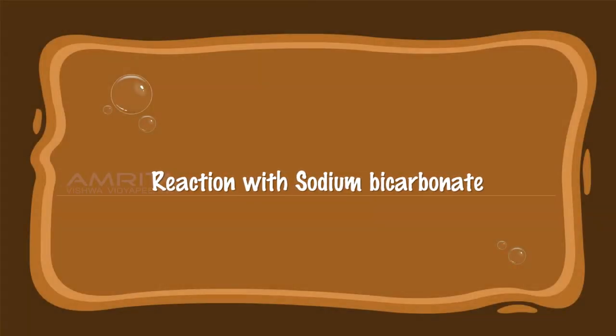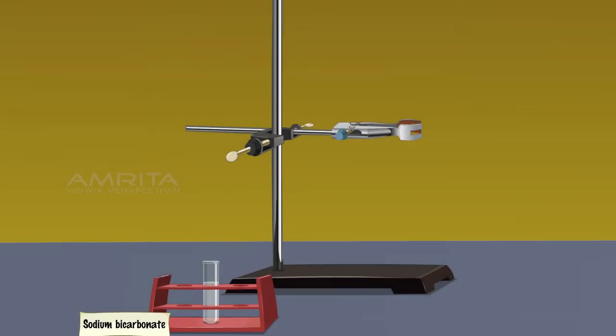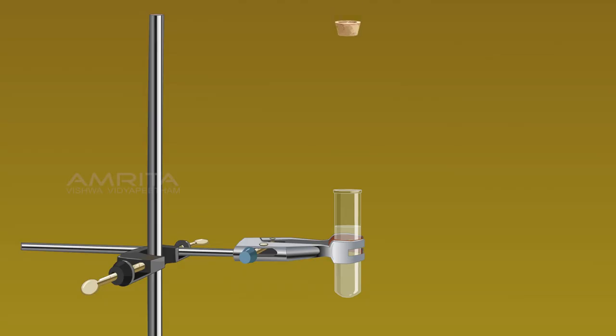Reaction with sodium bicarbonate: Take a small quantity of sodium bicarbonate in a boiling tube. Clamp the boiling tube to a stand. Close the mouth of the boiling tube with a double-bored cork. Insert a thistle funnel into the tube through one of the holes in the cork.